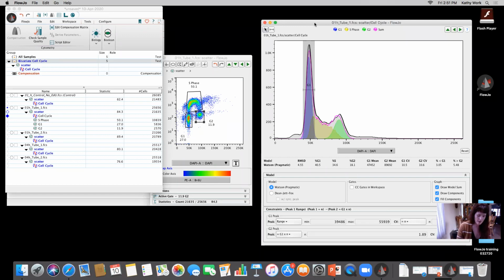Then what winds up happening is it splits. That parent then becomes 2 daughter cells. Now, what winds up happening? There's a limitation to the amount of dye that's in there. So when that goes to 2 cells, what do you have? You have daughter 1 that has 5 and daughter 2 that has 5. What would that equate to when we're looking at MFI? This is one event that has double the amount that's in these 2 events.